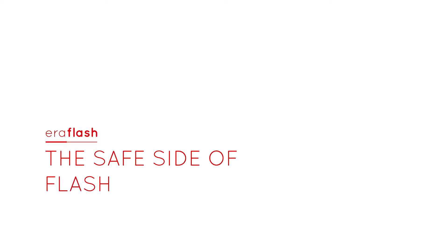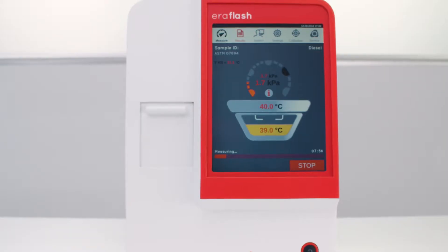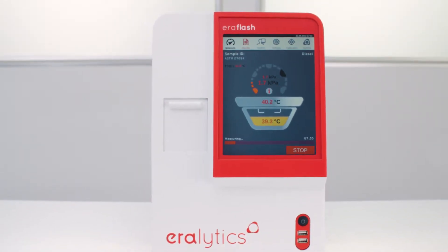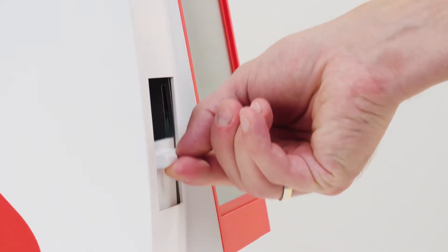ERAFLASH — the safe side of flashpoint testing. The state-of-the-art flashpoint tester, ERAFLASH guarantees maximum safety using the intrinsically safe, continuously closed cup method ASTM D7094. There is no open flame and no glowing wire, which completely avoids any risk of fire in the lab.